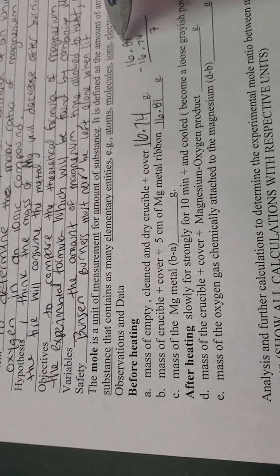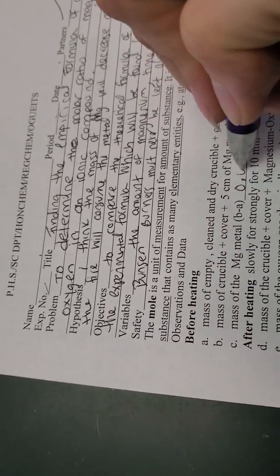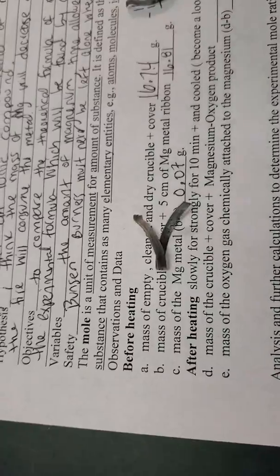One minus 4, that's like 11 minus 4, which is what? Oh my God, 7? I can't even do math. Okay, 7. And then 7 minus 7 is 0, 0, 0. So 0.07. And that's the mass of the metal. So that little piece of metal right there, that would be the mass of that metal.